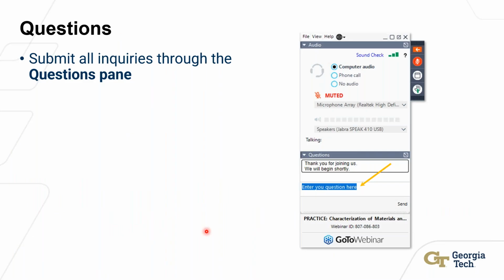There are also ways in amorphous samples using 4D STEM to calculate the elastic strain locally in your material. Christoph Gammer has done a lot of work in that area, where you can collect these diffraction patterns. A diffraction pattern from an amorphous region is just going to be this kind of halo, this ring. And you can look at the aspect ratio of that ring to calculate the local elastic strain in your material. So you can get local elastic strain, you can get global plastic and elastic strain, and you can get somewhat local plastic strain. Yeah, so there are approaches and techniques for that. Okay.